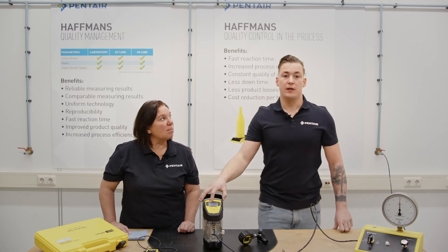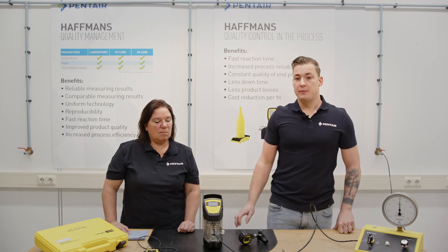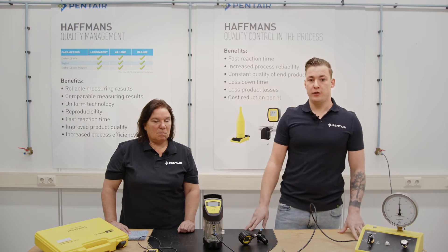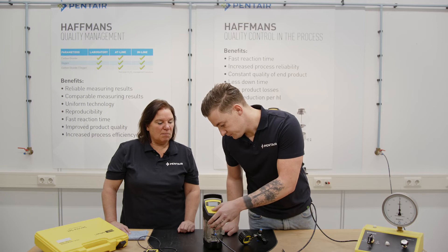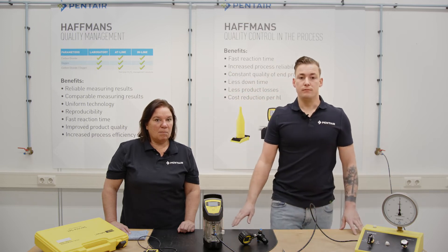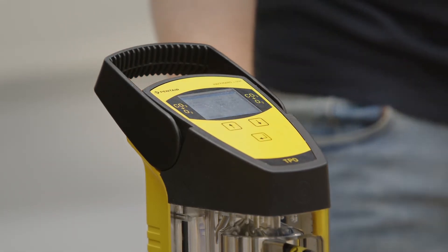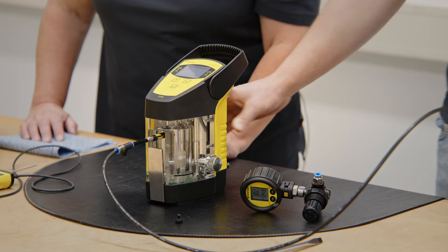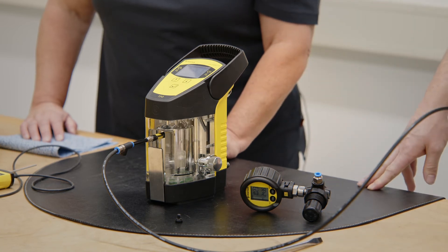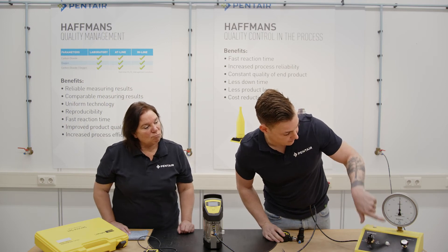Then to calibrate the zero point, open the plunger with the handle. Now the measurement chamber and the pressure sensor inside are fully open to atmospheric pressure and you enter 0.0 bar. Now the high point is selected — close the plunger and connect the precision manometer to get pressure. Set two bars on the calibration meter and enter the exact pressure value read from the manometer. So we have two bars.